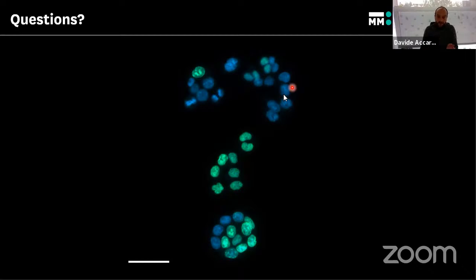It's not extremely important in a single-point scanner confocal, because, as Rino said, you can flexibly adapt the number of pixels and the sampling factor. But if you have a camera-based system, then the magnification of the lens plays a crucial role. And there are also other magnifying factors that can be present in the optical path.